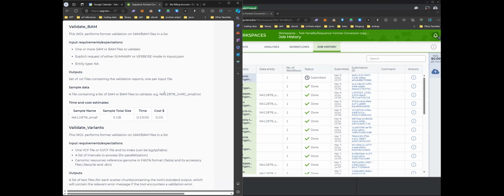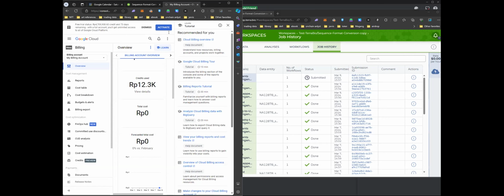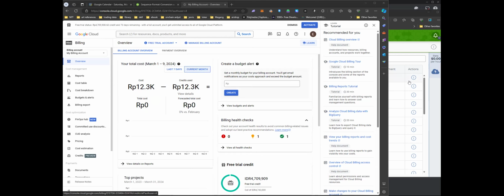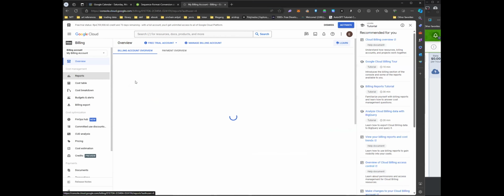Because this entire workflow needs computational power from Google Cloud Platform, it needs $1.13. We could check it from here. So this is Google Cloud Platform. You can use this one, maybe I will copy it in here. So you can see your bills here. So this entire workflow we used costs almost $1. So this is it. You can see the report here too.